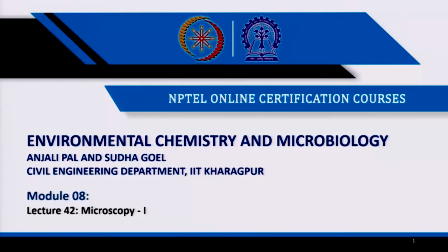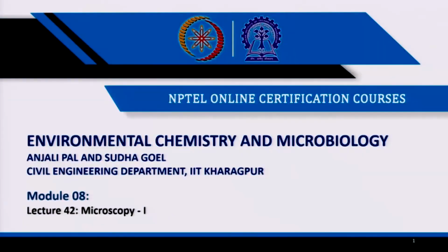Welcome everyone to lecture number 42, and this is a new topic that we are starting today, and it's one of the most important topics in environmental microbiology, and that is microscopy. It's divided into two parts, and we're going to go through some of the developments in microbiology. How do we visualize microbial organisms, and what are the limitations of these methods? We're going to go through all of that.